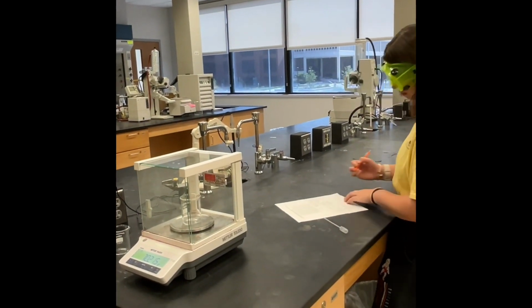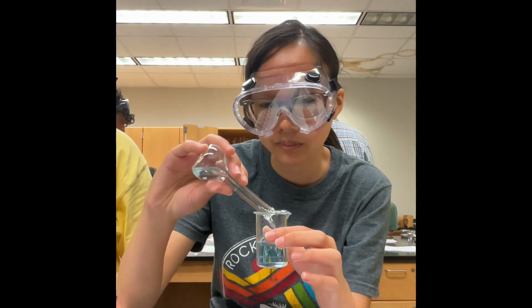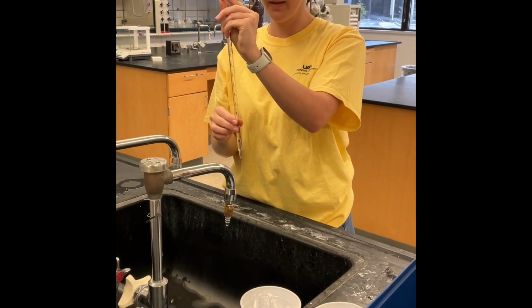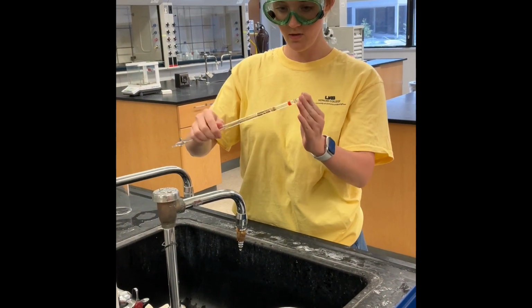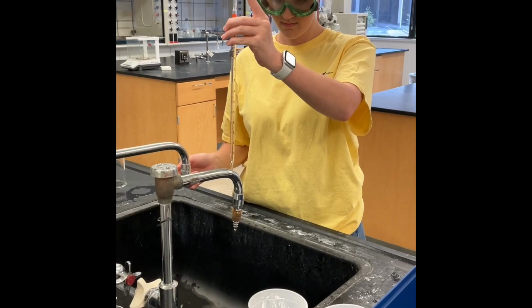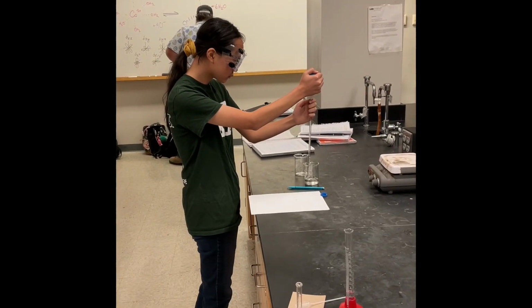With the density equation from before, we can calculate the density based on mass of the solution using the difference of mass of the beakers before and after putting the stock solution in, and the volume of 25 milliliters. Using the calculations from before, we know that 15 milliliters of our 20% solution will be combined with water to produce 20 milliliters of 15% solution.